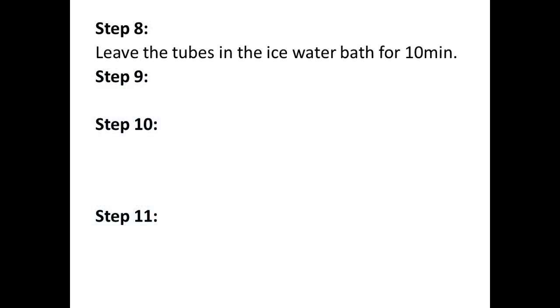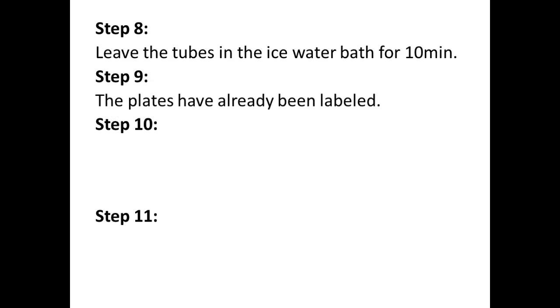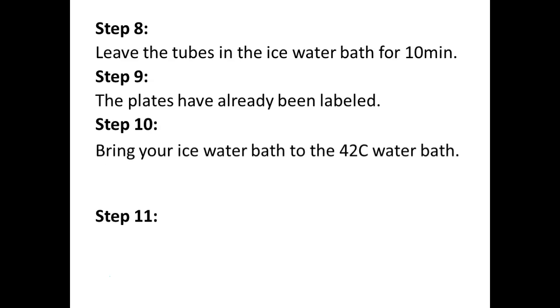So our next step is we're going to leave those tubes on ice for 10 minutes. Once those 10 minutes are up, in your book it says to label your plates. Your plates are already labeled because it's easier for me when I'm preparing these plates, because some of them contain ampicillin, some contain ampicillin and arabinose. Some of them don't have any of those additives. It's just easier to label them as I make them to keep them straight. So you guys don't have to worry about labeling them. It's already done for you.